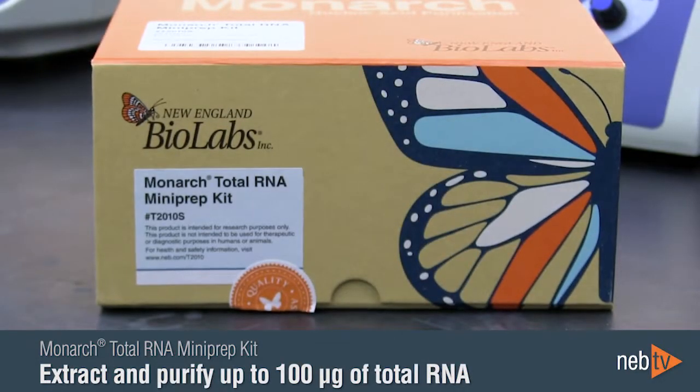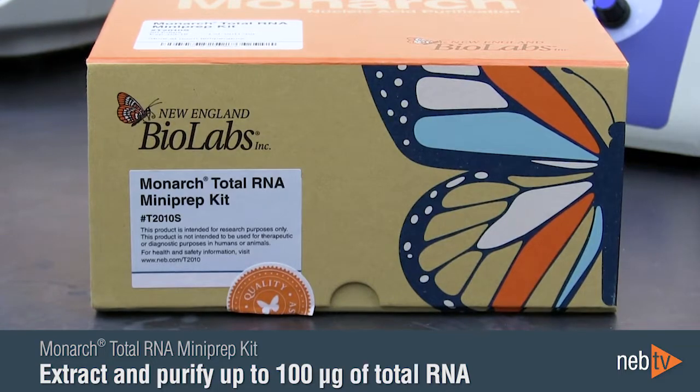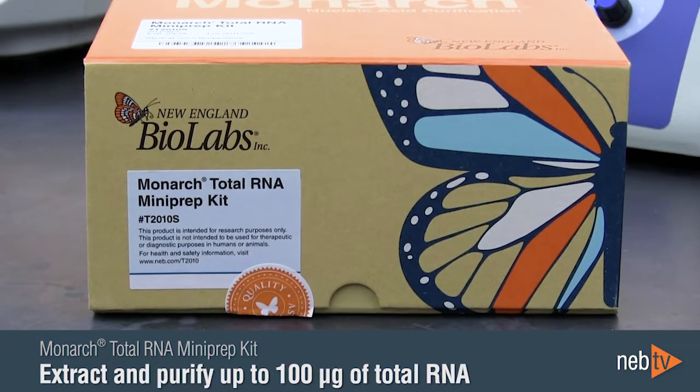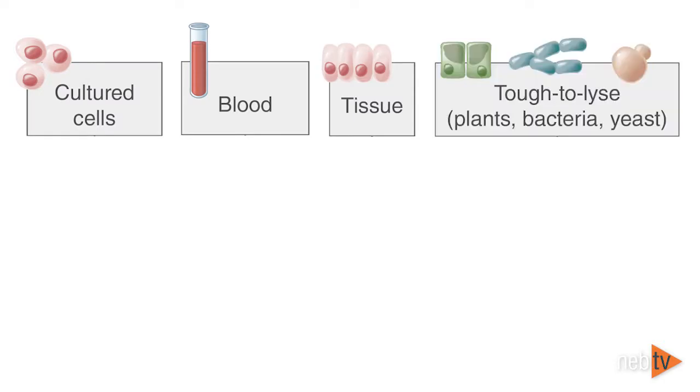The Monarch Total RNA MiniPrep kit can be used to extract and purify up to 100 micrograms of total RNA from a wide variety of sample types, including cultured cells, blood, and various tissues. Tough-to-lyse samples, such as plant, bacteria, and yeast, can also be processed with this kit with a few added steps.